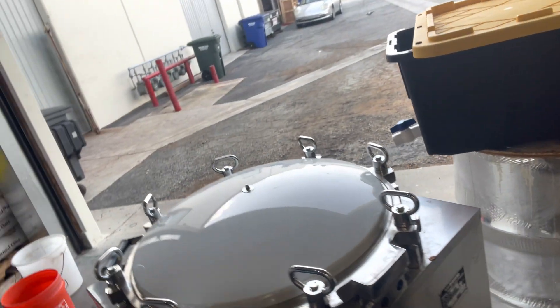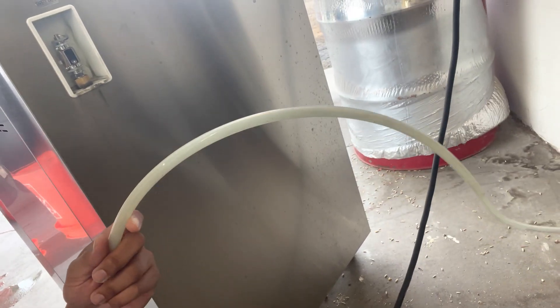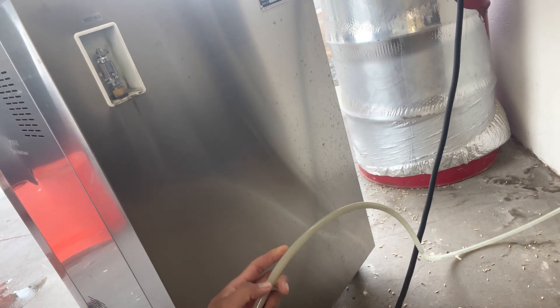It runs on 240 volts - I have my 240 plug there. It comes with the line but not the plug, so I had to install that. There is this pipe or tube for one of the valves - sometimes it kicks on and blows steam out. Here is my safety valve, set at 15 PSI. That protects the machine from getting over-pressurized, and it's a great safety feature because you can kind of set it and forget it.